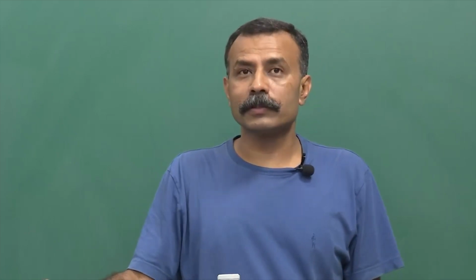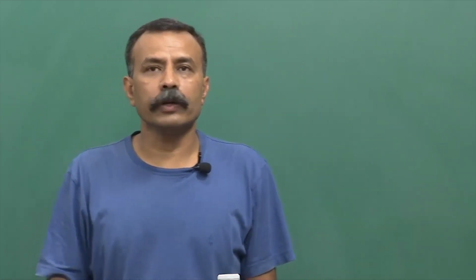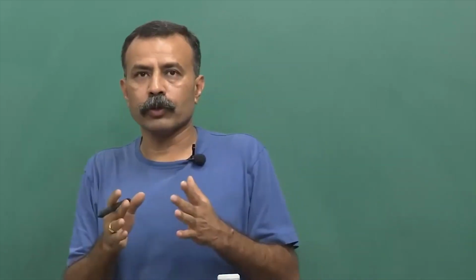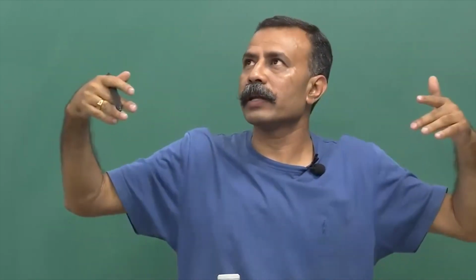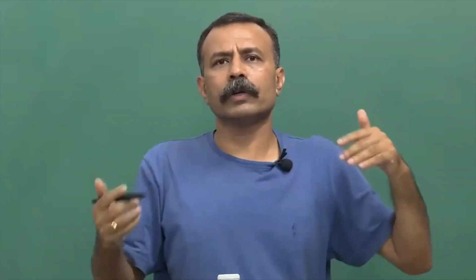You have to talk to your colleagues in engineering, or in the works department of the institute, about how you can have a false roof. For example, I am standing in a room where I know there is a false roof. You all have heard about a false roof.